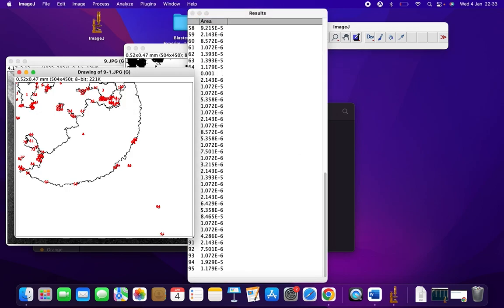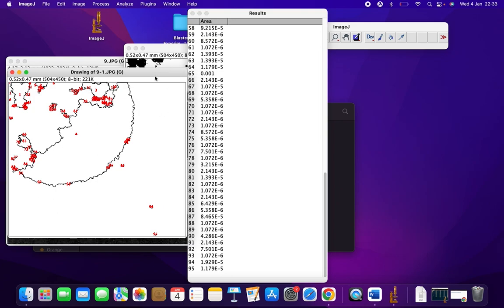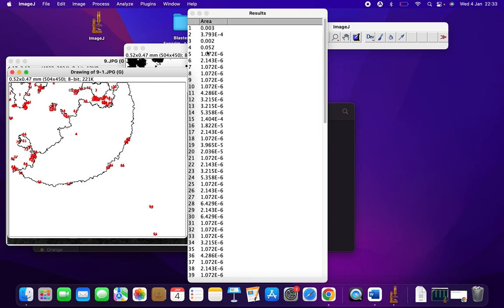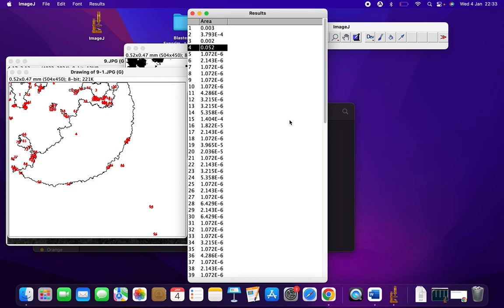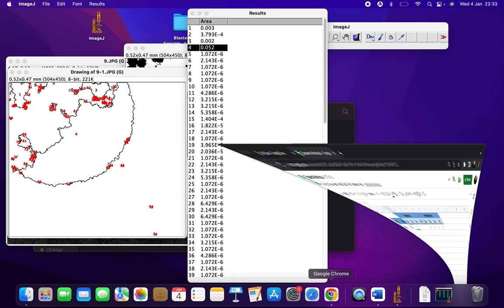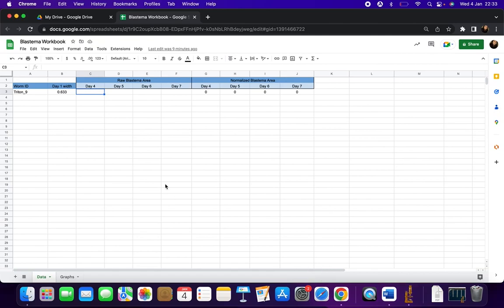From here we can see that in the outlines image, the blastema is labeled number 4. So we will go under Results and look at the area of number 4, which is 0.052. This is the area of blastema, which we can record in the workbook template on day 4 for sample 39 as 0.052. As you can see, the normalized blastema area will appear automatically.